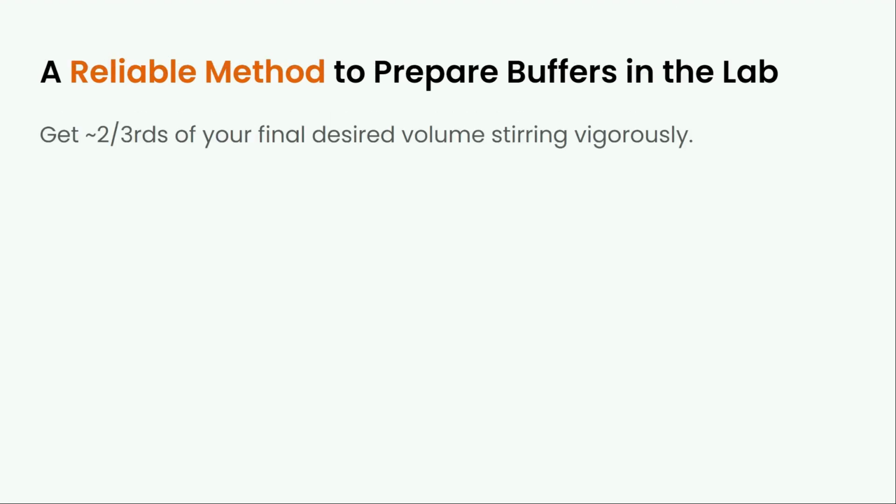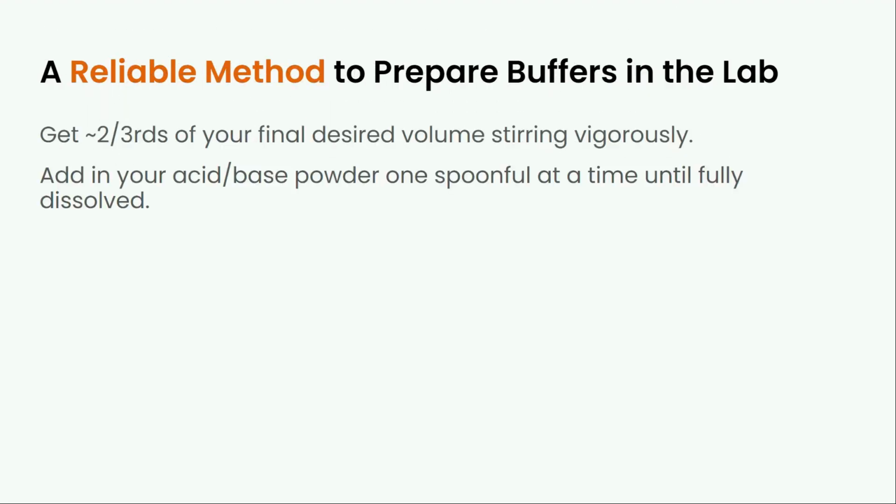So just wrapping things up then. A reliable method to prepare buffers in the lab, it's easier than you think. It's just one slide's worth of instructions. So basically, get 2/3 of your final desired volume, stirring vigorously.